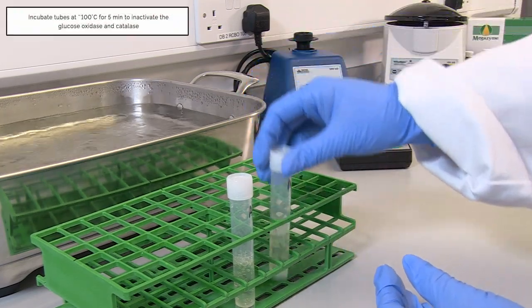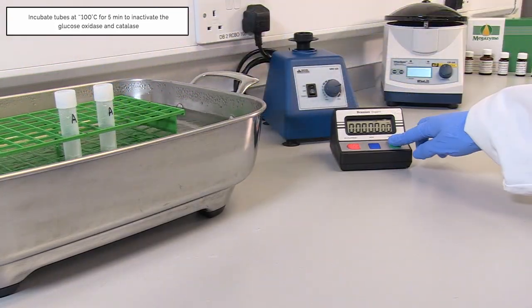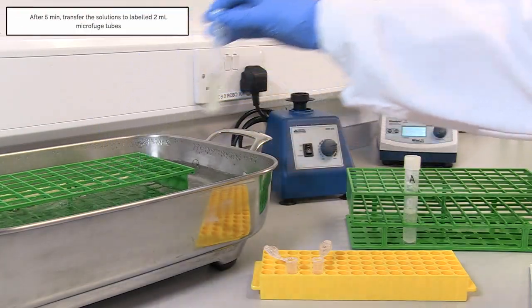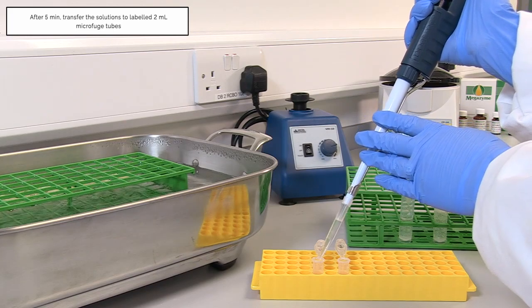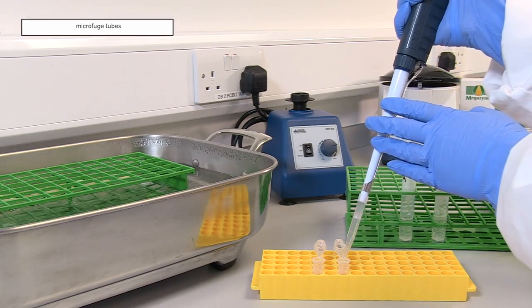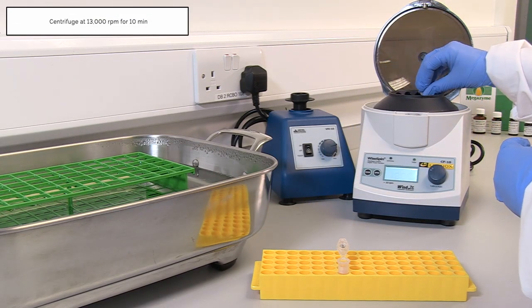Incubate tubes in a 100°C water bath for 5 minutes to inactivate the glucose oxidase and catalase. After 5 minutes, remove the tubes from the water bath. Transfer the solutions to labelled 2 ml microfuge tubes and centrifuge at 13,000 RPM for 10 minutes.